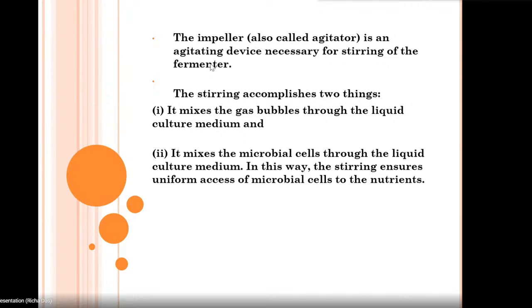Second function, as I said, is that we have to prepare a proper homogenized mixture. Whatever nutrients or sugars you have provided in the production media, we want them to be thoroughly mixed with each other. Now why do we want this? Because we have to make sure that each and every microorganism gets an equal amount of all the nutrients. That is why impellers or agitators are used, because they are going to mix the content thoroughly and properly, such that each and every microorganism will be receiving equal amounts of those nutrients.